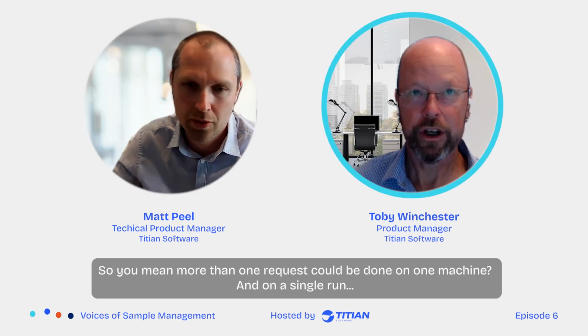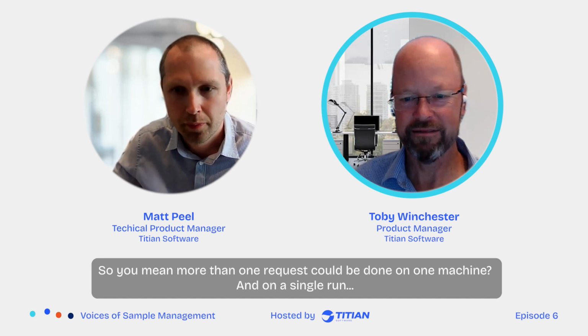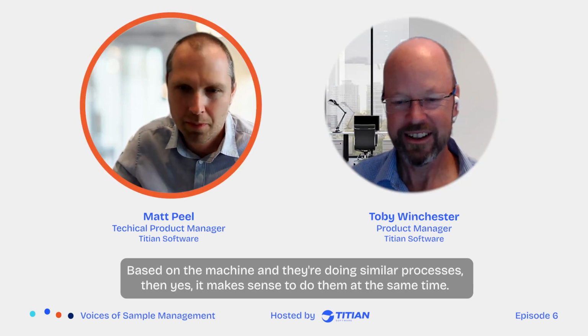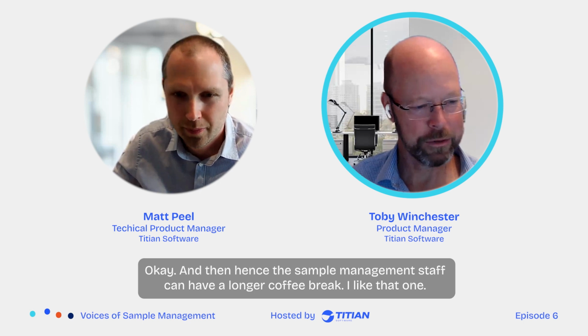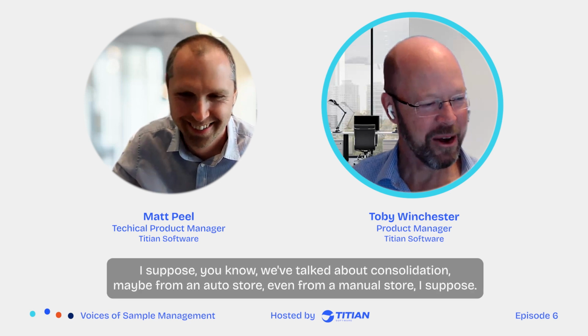So you mean more than one request could be done on one machine? In a single run, if it's based on the machine and they're doing similar processes, then yes, it makes sense to do them at the same time. Okay, and hence the sample management staff can have a longer coffee break. I like that one. Yes.